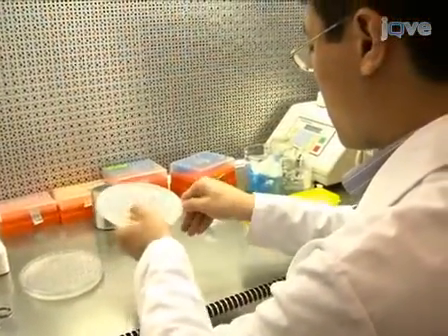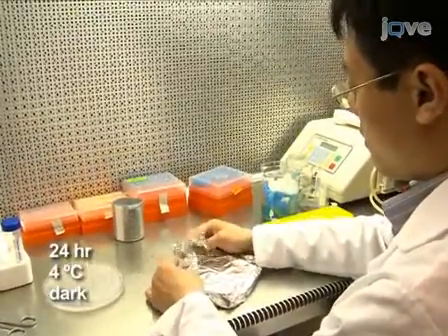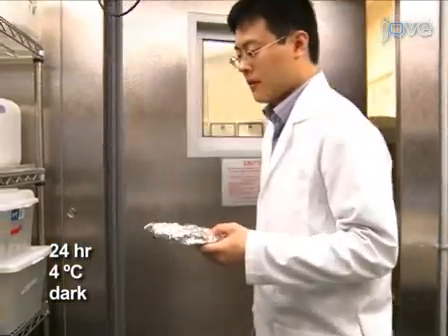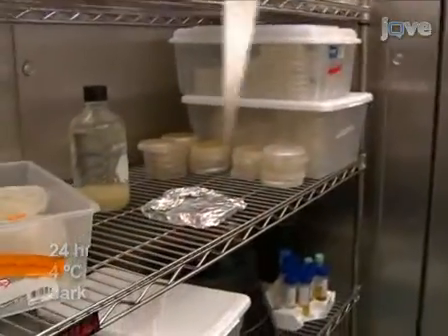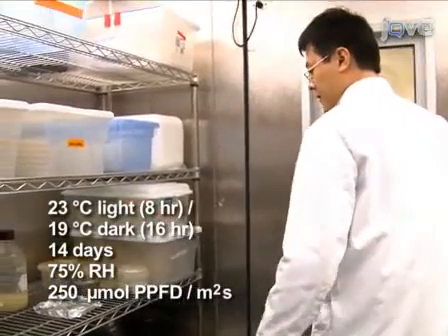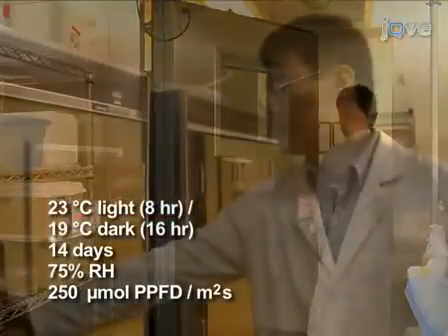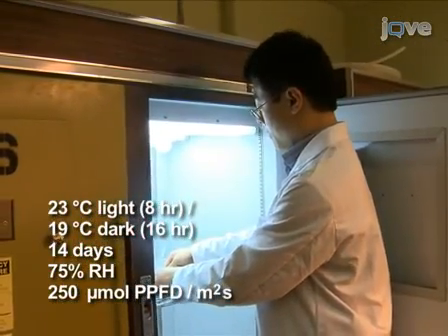After spreading the seeds, keep the seeded plates for 24 hours at 4 degrees Celsius in the dark for stratification. Following the 24 hours of incubation, transfer the plants to a growth chamber and grow them for 14 days at 8 hours light and 16 hours dark. The 14-day-old seedlings are then ready for harvesting.